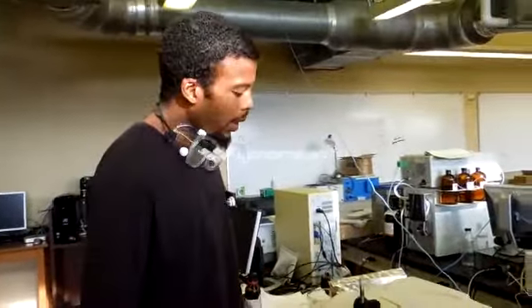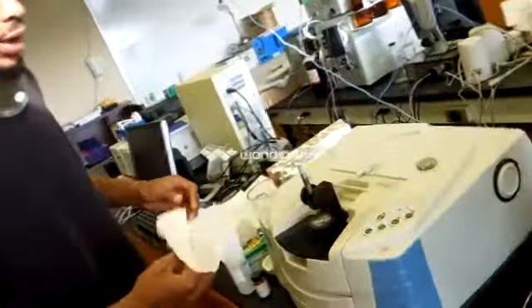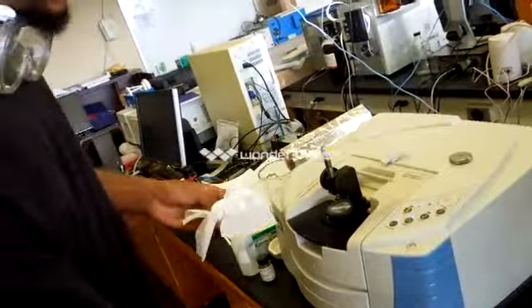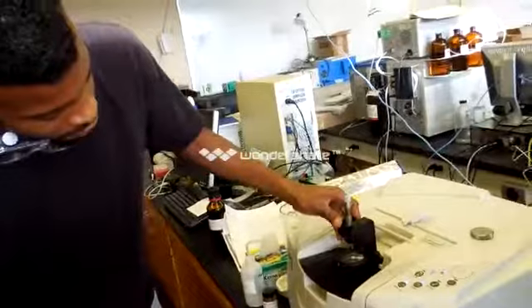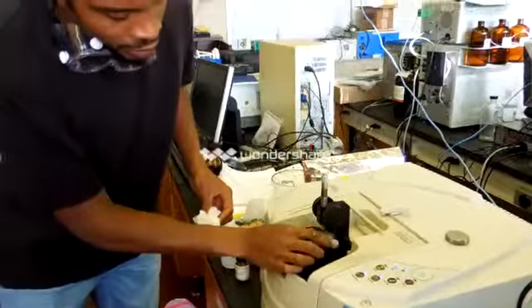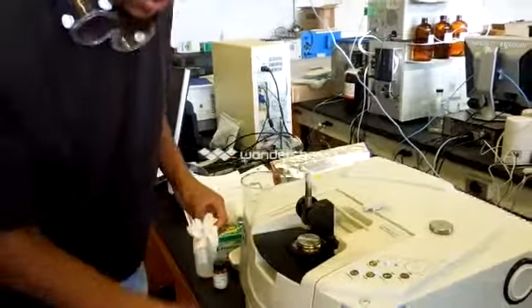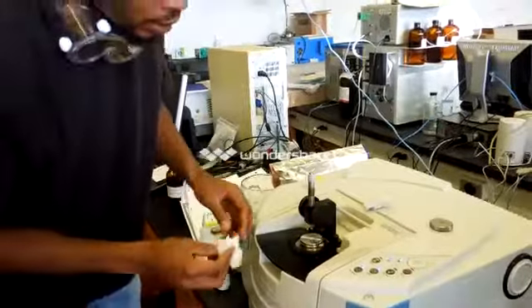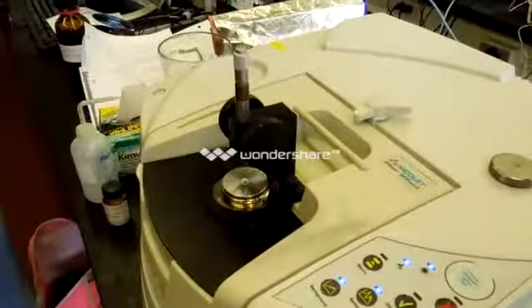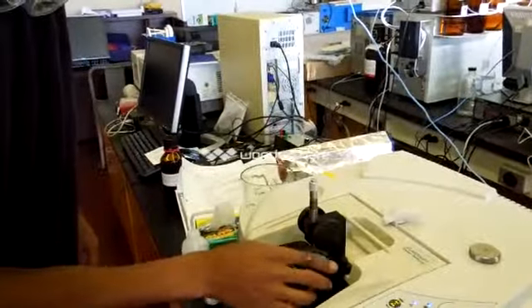First you want to start off by cleaning the center here where you put your sample. You've got some chem wipes and some DI water, and you want to wet it some. First make sure that this is adjusted all the way in its top position so you have some room to work with under there, and unscrew this cover. You take this cover off. It's not really important to clean that part of it. You do need to make sure you clean the center, and that is where your sample is going to go. Then you go ahead and screw that cover back on.